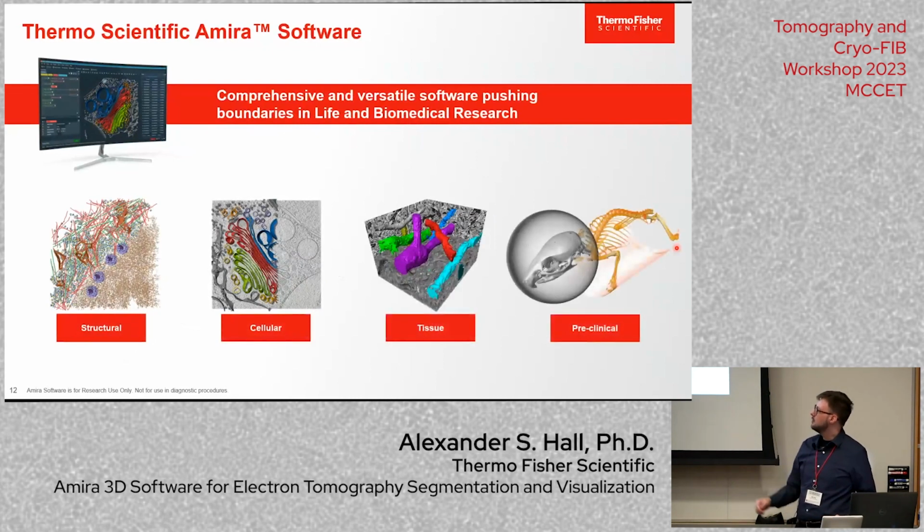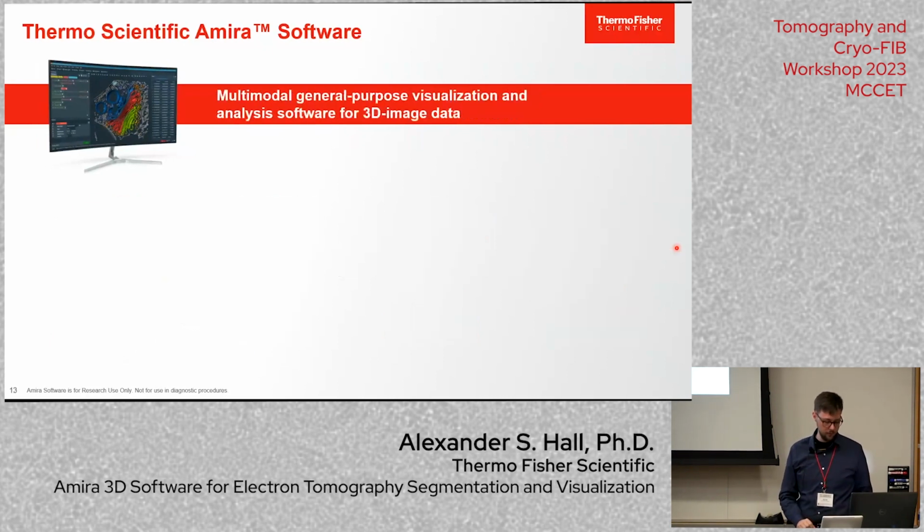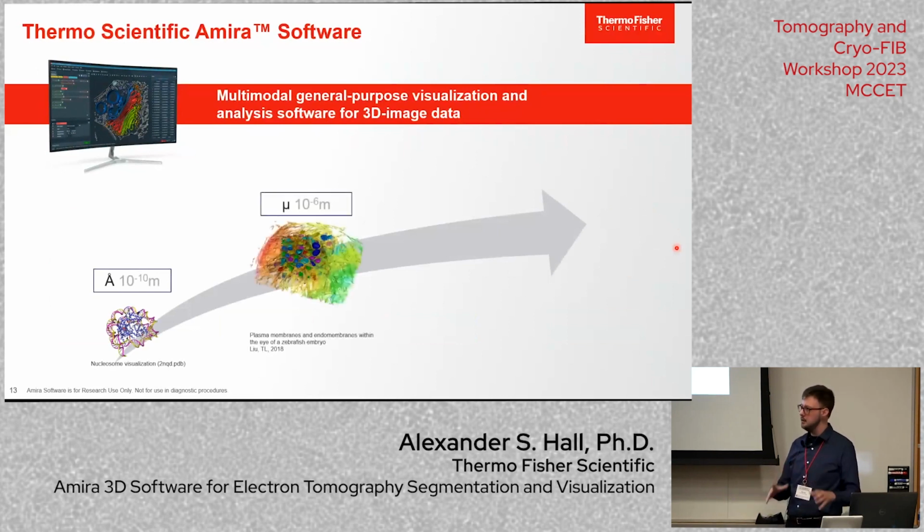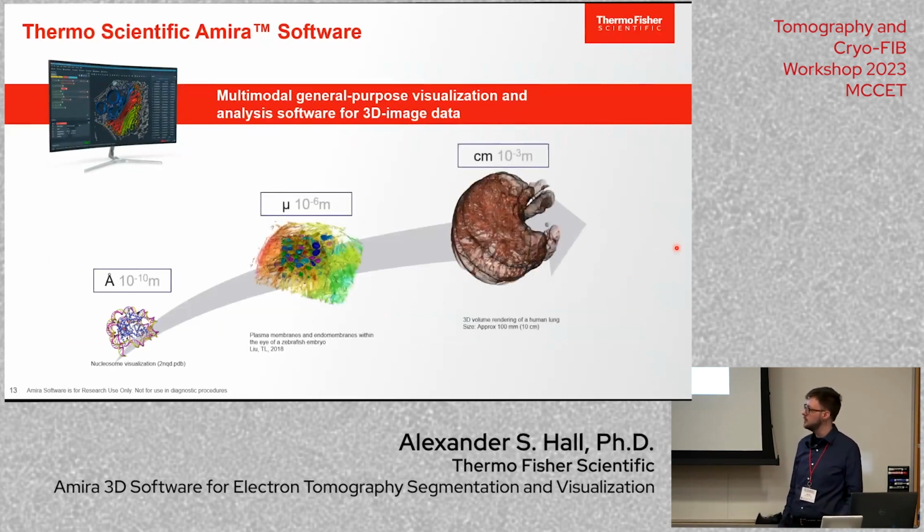So yeah, this is large volume analysis, much larger compared to the TEM that you're working with. And then if you're working with CT data, which is how I got my start in visualization, Amira is quite capable of working with those data types as well. We're also not focused on a particular sample size. As I mentioned, you can do molecular visualization. This audience would be interested in the angstrom to nanometer scale, but we're quite capable of also working with organ or even much larger sample analysis.